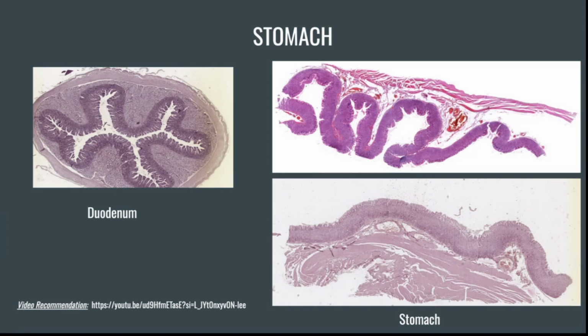But it is important that you zoom in on the slides and look for specific structures, and not just look at the slide with your naked eye. It is good to have a basic idea, and I'm not saying that it is bad to have any idea before looking at the slide by naked eye, but you should not just trust that. You have to zoom in and be 100% sure of your answer, because you only get one chance.